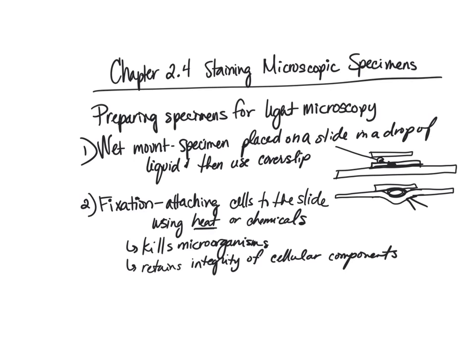So when we heat fix it, you spread a thin layer of the specimen on the slide. This is called a smear.